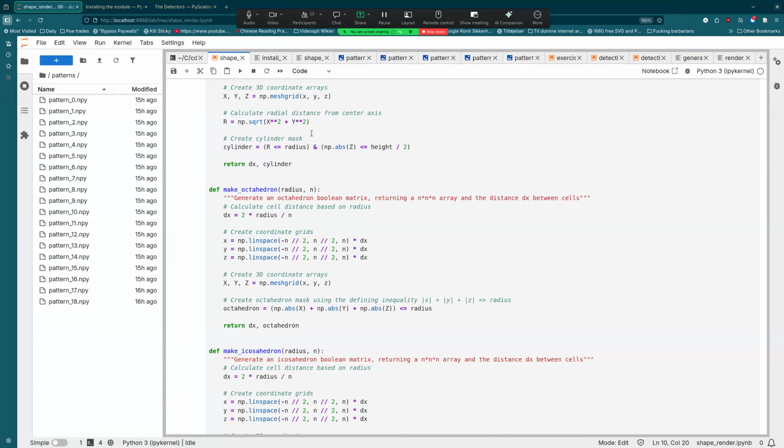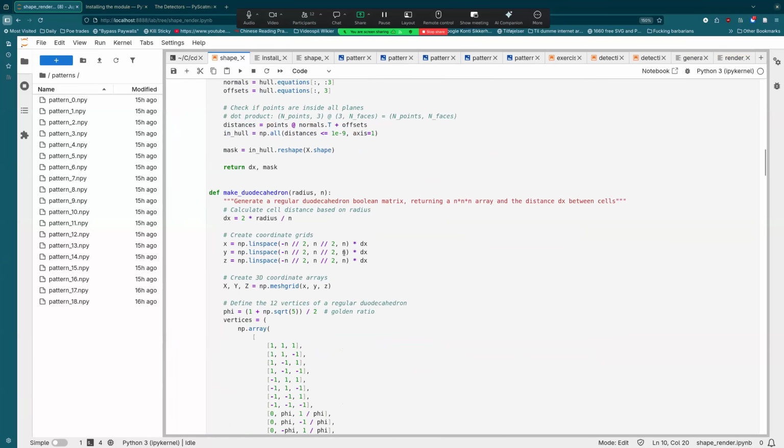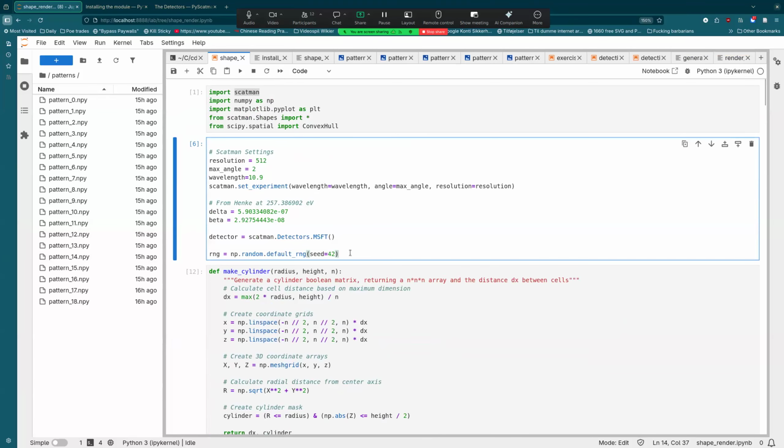Density also, no? Density and refractive index like this. Yeah, but by default it assumes, obviously the shape will somehow influence it. I mean to say that if a spherical nanoparticle is made of two different types of material, both having different optical properties but identical shape. Okay, yeah, this can be done.